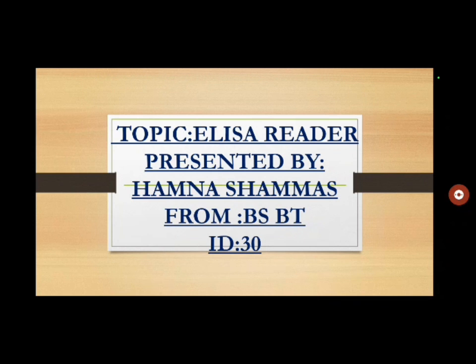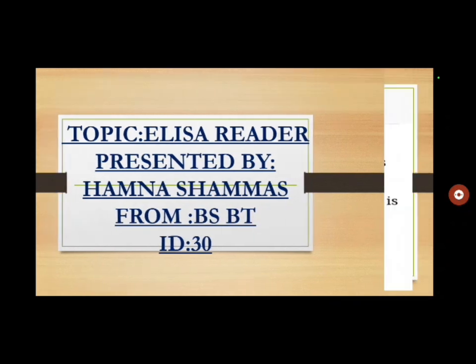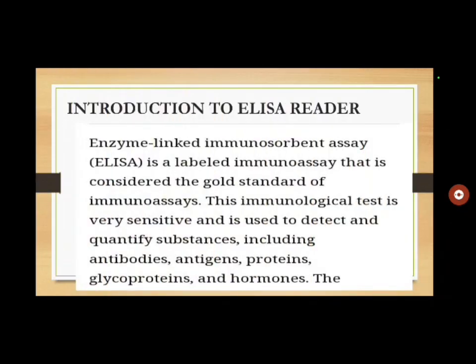My today's topic of presentation is ELISA reader. So what is ELISA reader basically? Introduction to ELISA reader. Enzyme linked immunosorbent assay is a labeled immunoassay that is considered the gold standard of immunoassays.